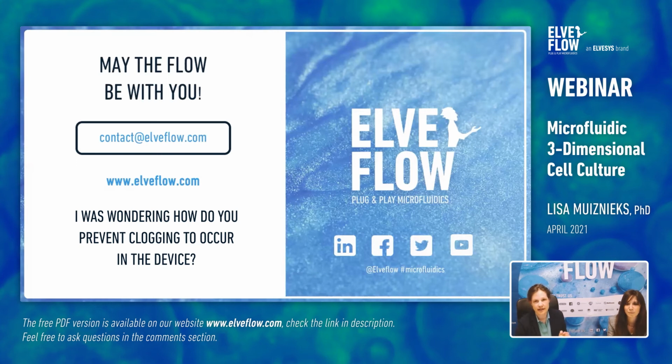The gel has an inlet and an outlet that you enter the gel into and polymerize it in the chip. And it's the side channels on either side which you flow the liquid through. So in this way, the standard procedures, for example, filtering your solution, will help you with stopping any clogging.